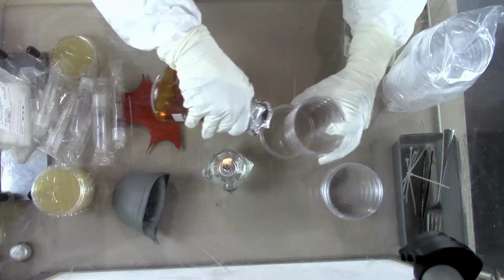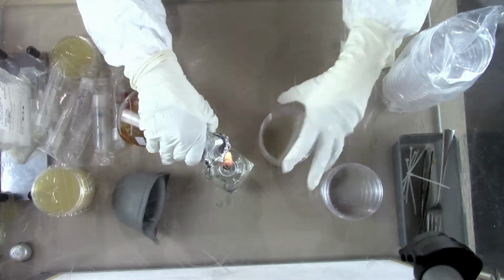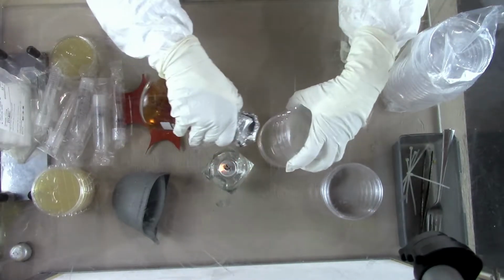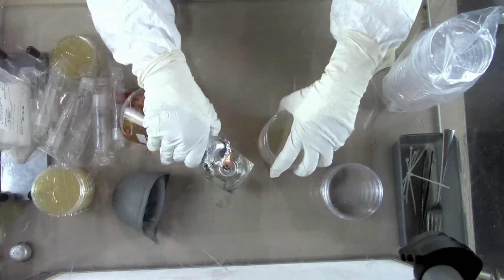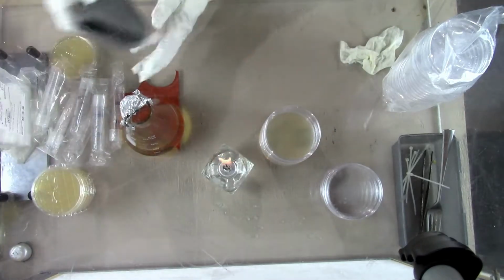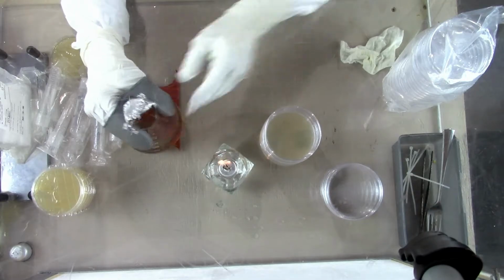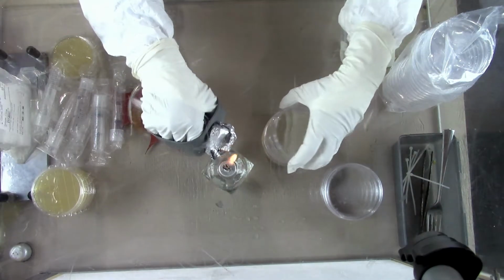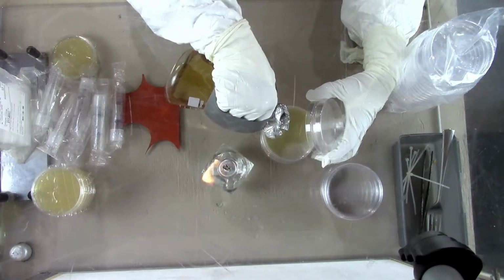So I stack the petri dishes and then I pour 15 to 20 mils in there. Now, there's no way that I can put exactly 20 mils in every plate, but experience gives you the edge. Of course, it is very hot, so you should be using your specific tools for this.